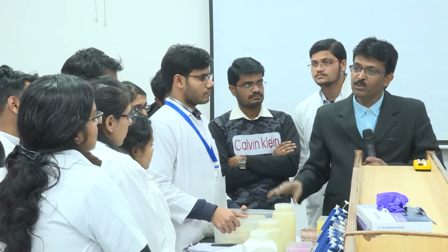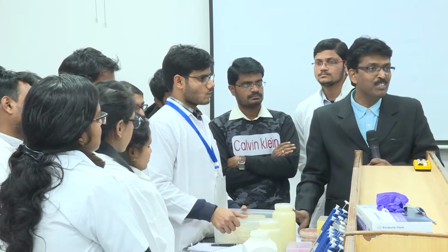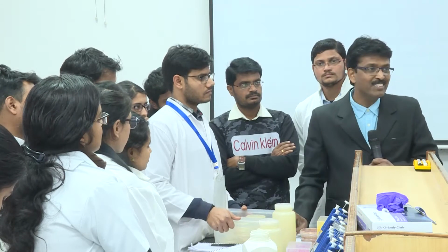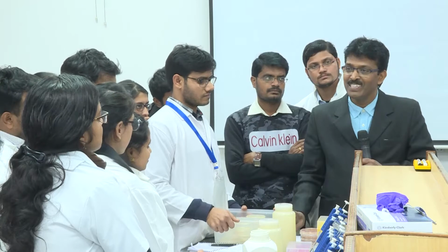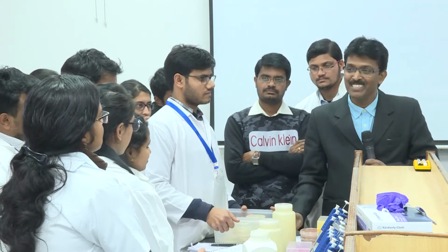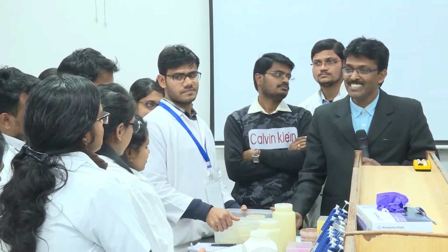I do not know how many of you noticed in my group, we don't store media in flasks. Did anybody notice? You will not see a flask with media in my team. I would say it is completely banned in my group. I don't like to see that, right? So why? Any idea?